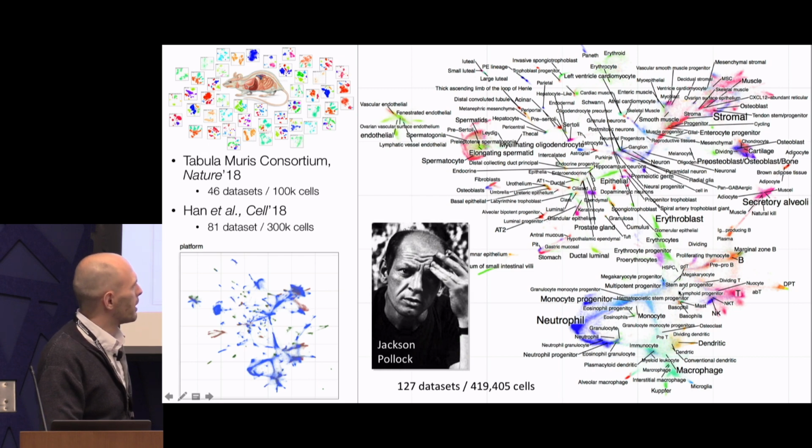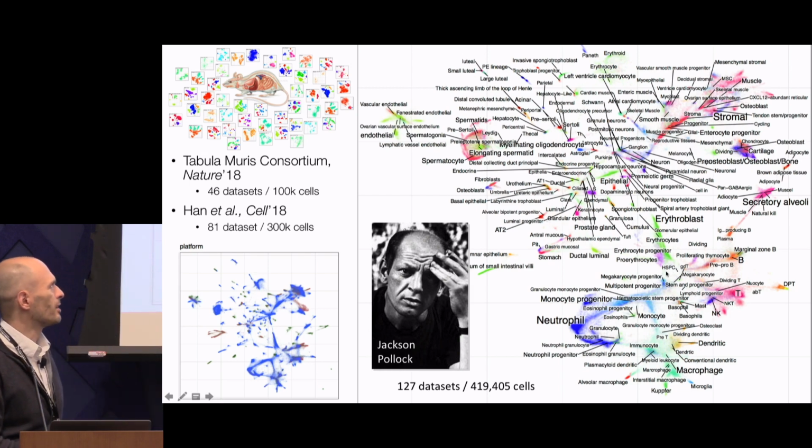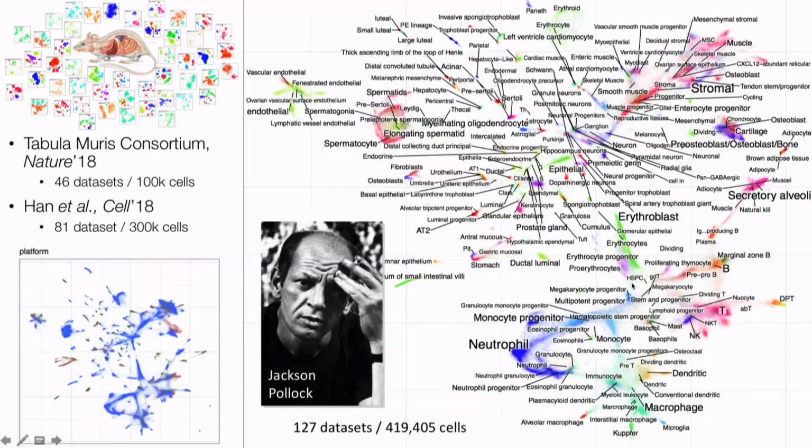But for instance, here we have hematopoiesis, and it's more or less laid out where you have progenitor cells over here, T cells on this T branch, B cells on this side, and then neutrophil, macrophage, and let's say erythroid, I think, goes up, and so on. So it laid it out reasonably well. But of course, I'm not insisting that this type of view of an organism is somehow the most informative one. All we're looking for is just a way of quickly visualizing and integrating it.